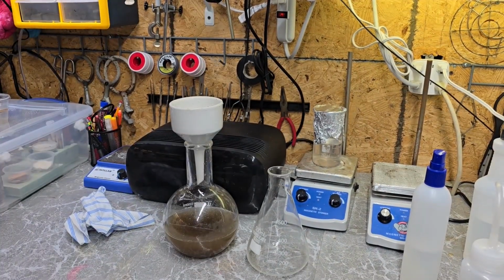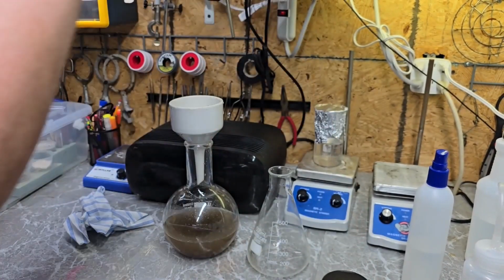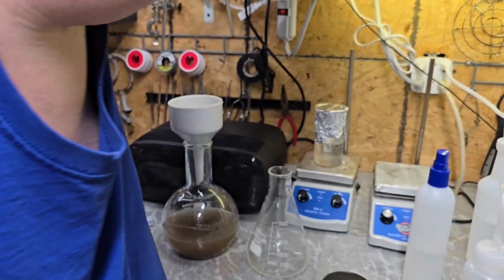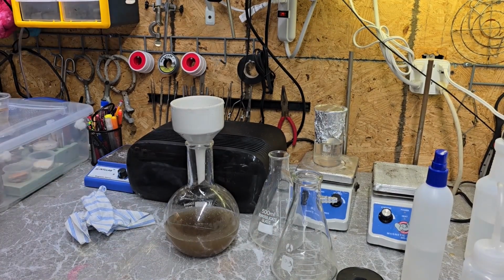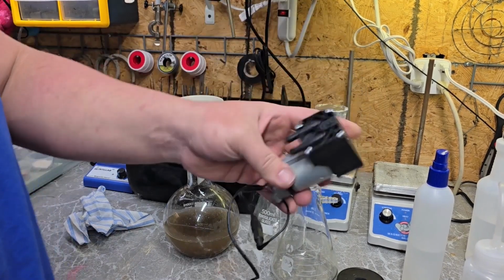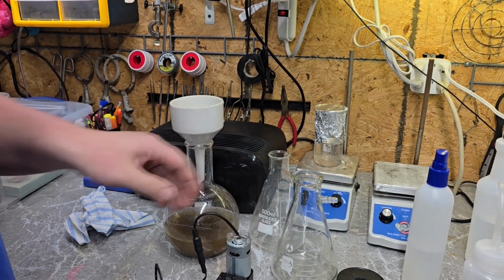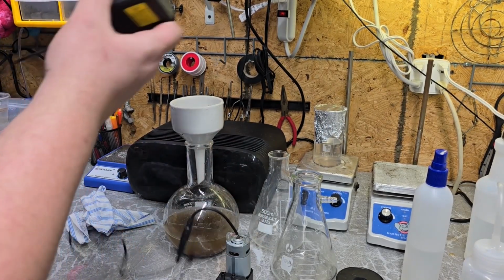Well, it looks like that Buchner funnel doesn't like to try to filter something without a vacuum pulling on it, so we'll give it what it wants. We'll set up a vacuum filtration setup. Get my vacuum flask. I do have an actual vacuum pump, but I'm just going to use this guy right here. This is just a little cheap $10, well, like $20 vacuum pump that I got off of eBay specifically for vacuum filtrations.